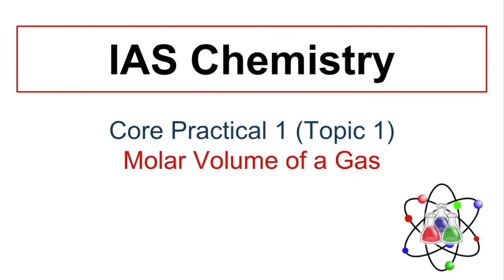So this is the first in a series of videos that are going to cover the core practicals for Unit 3. This video will cover core practicals 1 and 2, and the subsequent videos will cover core practicals 3 to 8. For the first core practical, it is how to measure the molar volume of a gas.